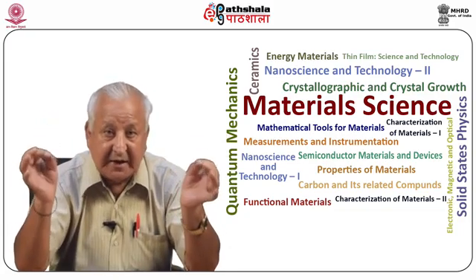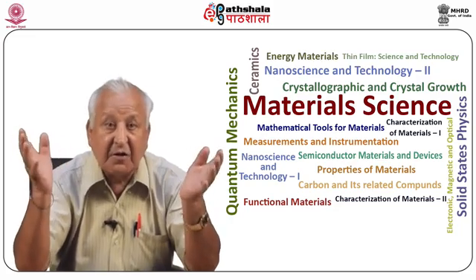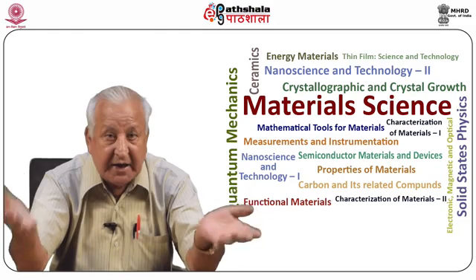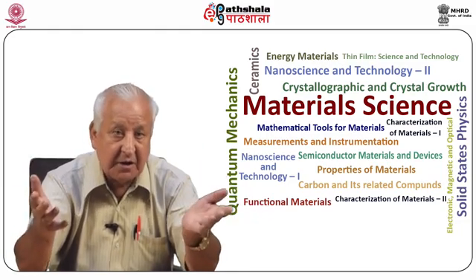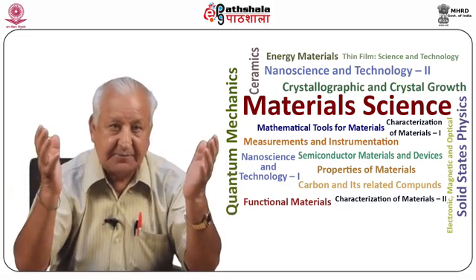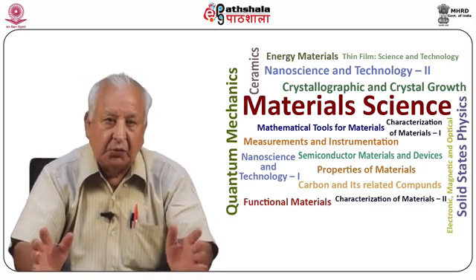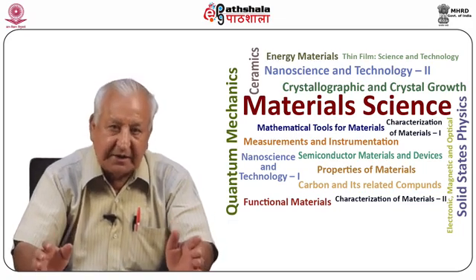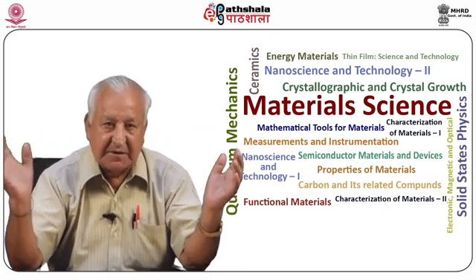Use of Laue diagrams in the determination of symmetry and structure of materials, orienting single crystals, and investigating distortion or polycrystallinity of materials is described. The powdered crystal method as a valuable tool, particularly for materials which are not available in single crystal form, is explained.